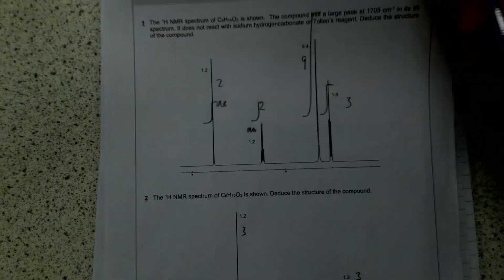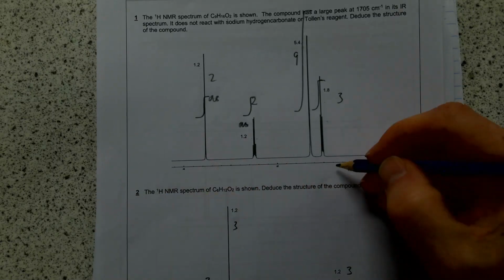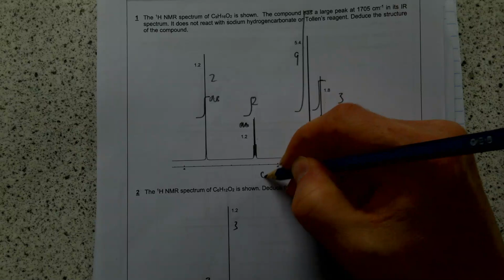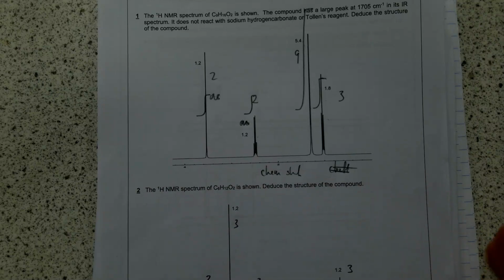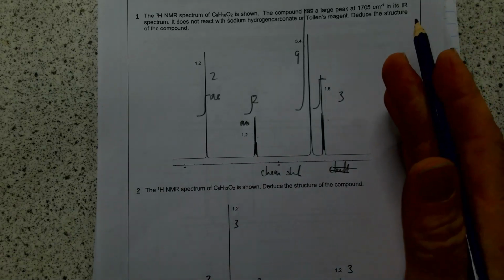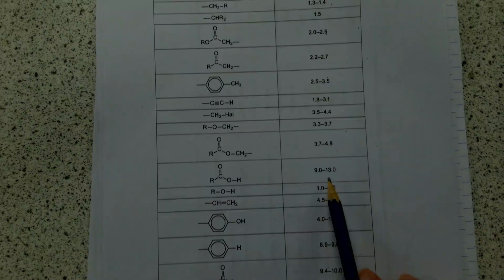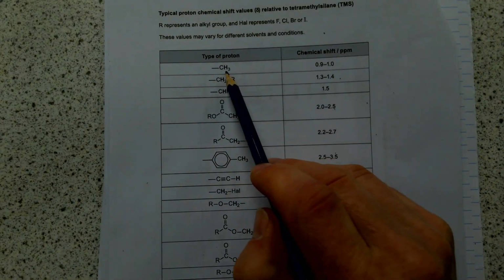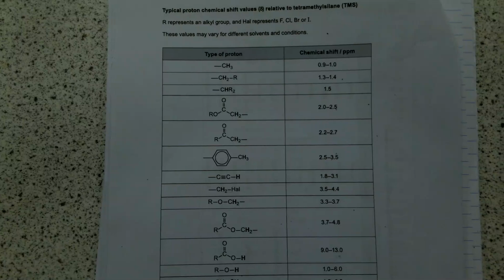Now if we look at those spectra I was just looking at before, you can see that the chemical shift is on the horizontal axis. I've written halfway between chemical and shift. Chemical shift is along that axis there, and it goes usually from 0 to 10. You can get extreme examples, up to like 13 for carboxylic acids. But notice in the data book that the hydrogens that we're interested in, or that are in that peak, are in bold.